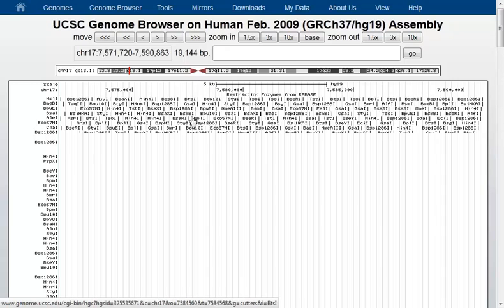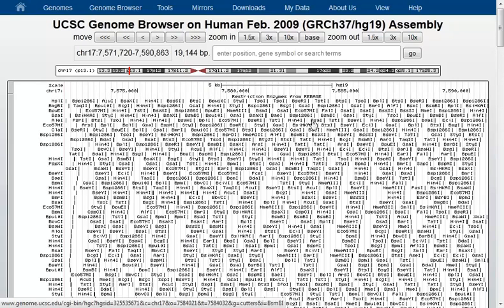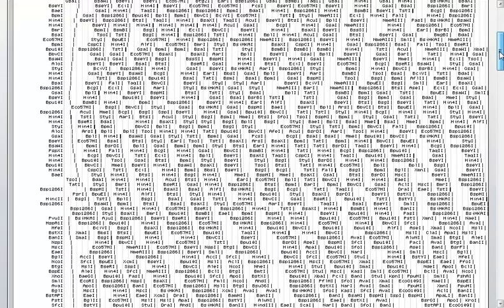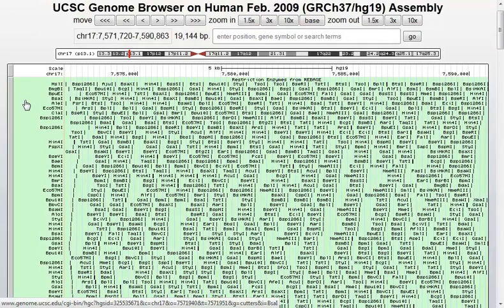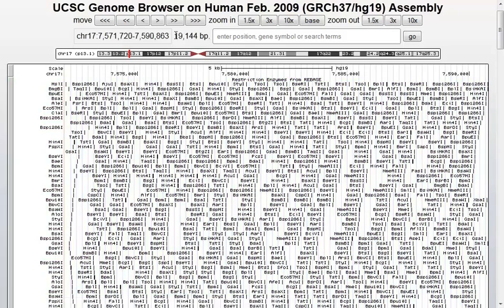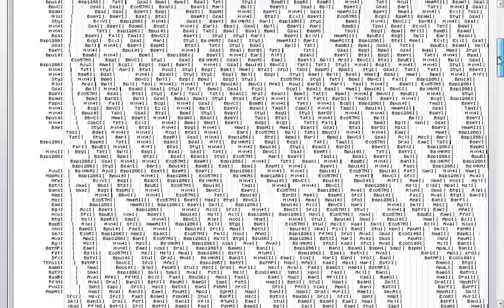This will load the Restriction Enzymes in this region all the way down the browser section. Now we've got a lot more information right here — it actually might be too much information, and it might be hard to look around. You've got a couple of options: you could zoom in to focus on certain regions, or another thing you could choose to do is filter.